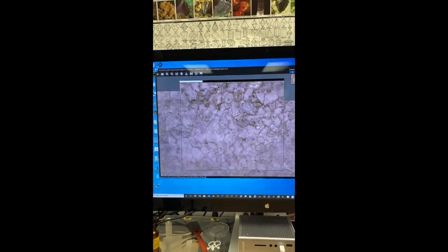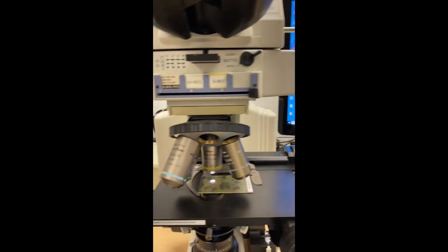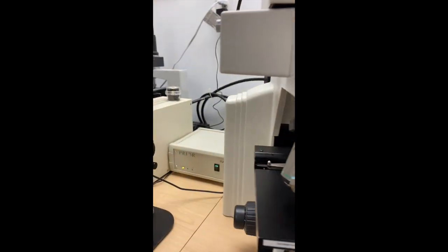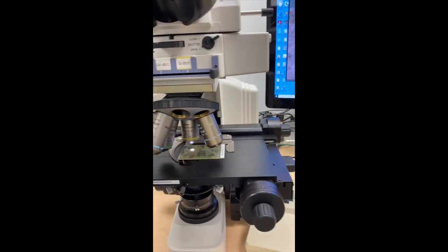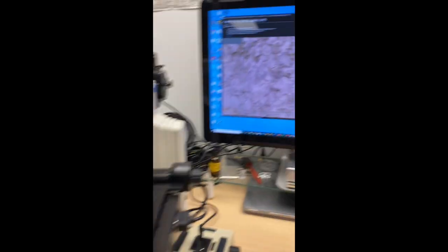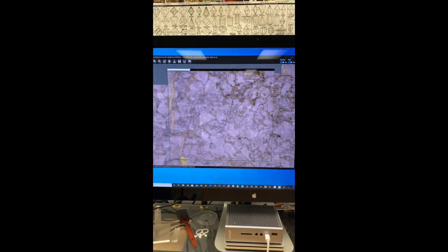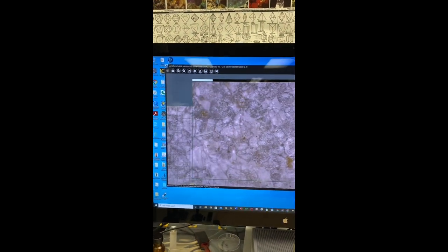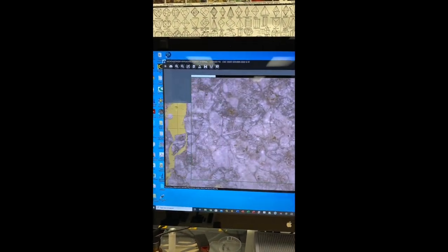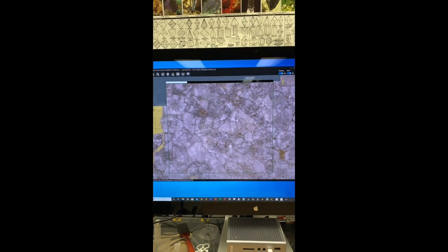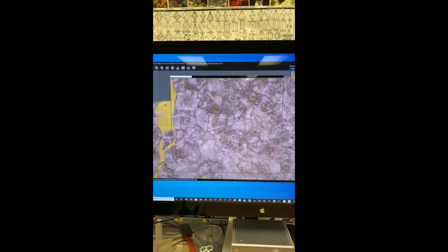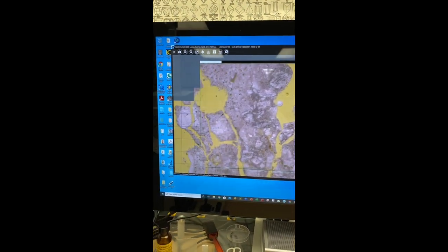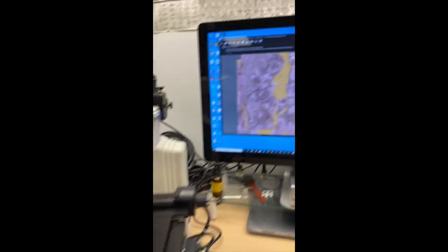But with the Prior controller OptiScan XY stage, you can automate Microvisioneer's manual WSI software to do automated scanning of your thin section with the motorized stage.